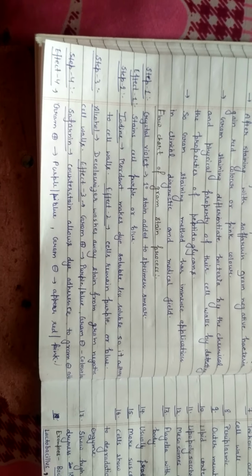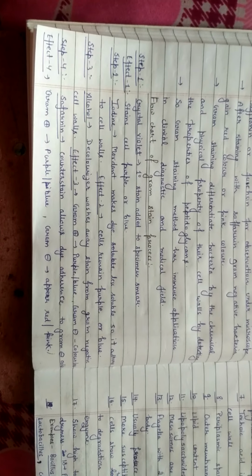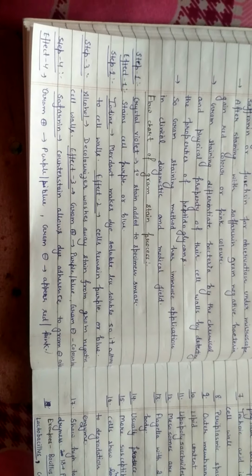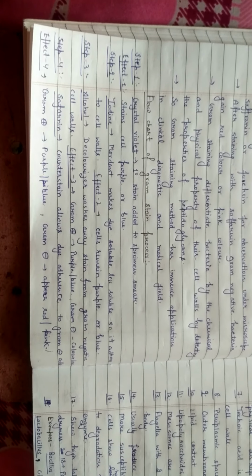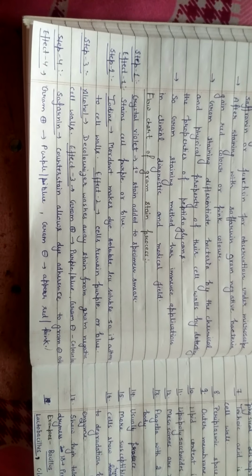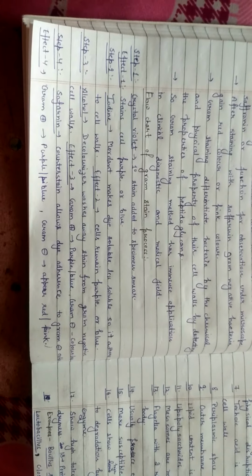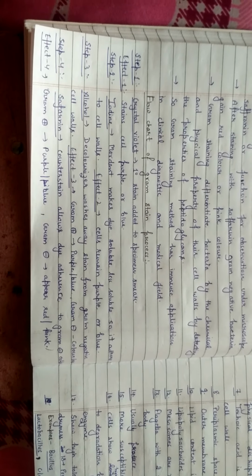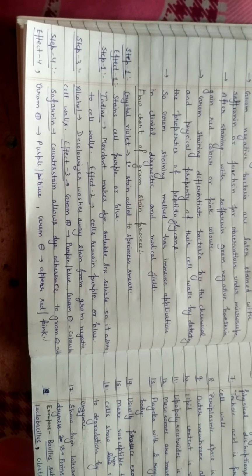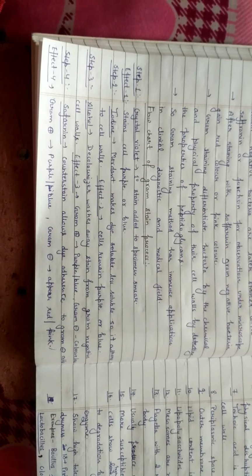So, on what basis did he do this experiment, and how did he differentiate between gram-positive and gram-negative bacteria? These two bacterial species are differentiated on the basis of their cell wall structure, on the chemical and physical properties of their cell wall structure. In this video, I'm not going to share the differentiation between gram-positive and gram-negative bacteria. I'm just talking about the technique of gram staining.